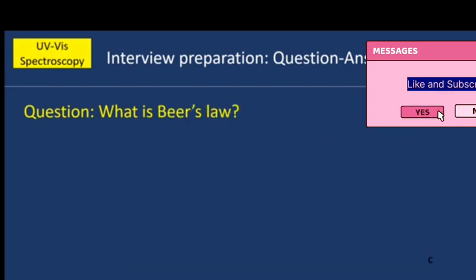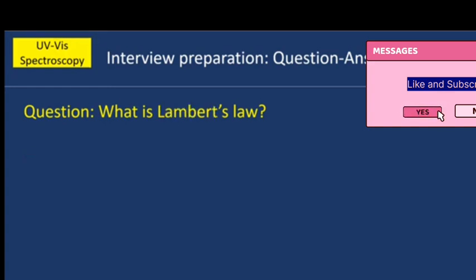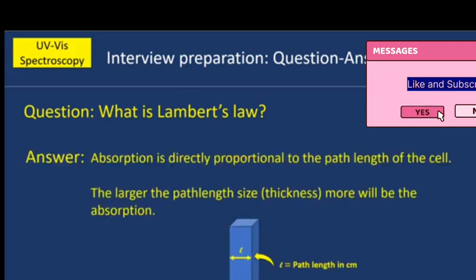Next question. What is Beer's law? Absorption is directly proportional to the concentration of the medium. More the concentration, more will be the absorption. What is Lambert's law? Lambert's law is absorption is directly proportional to the path length of the cell. The larger the path length size, more will be the absorption.